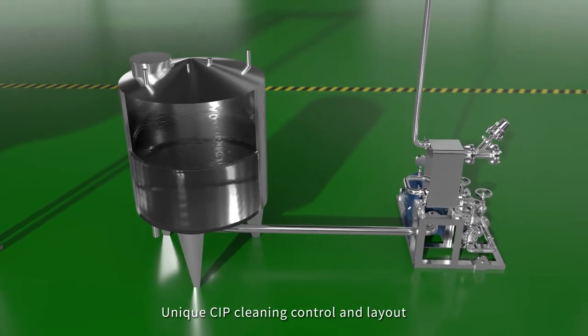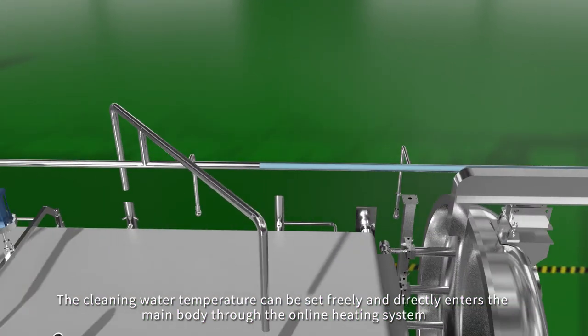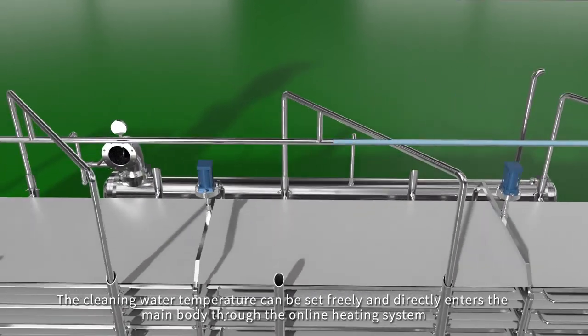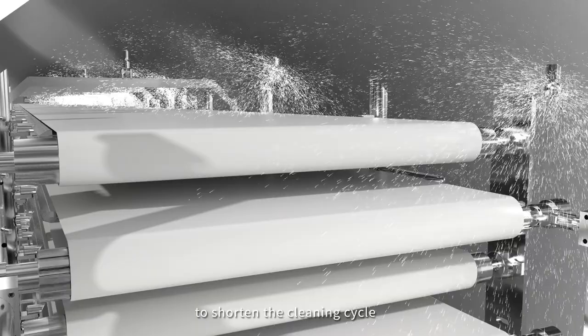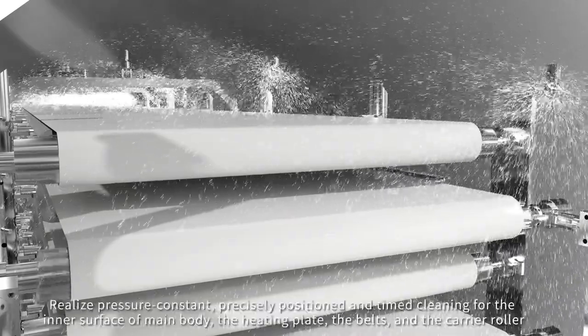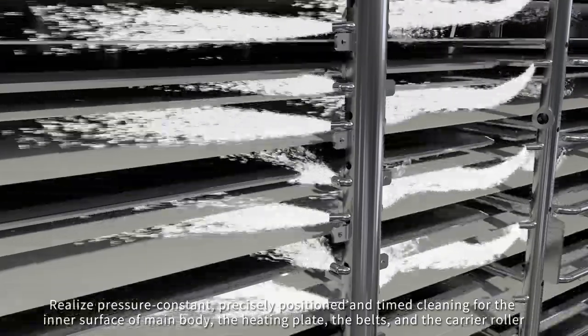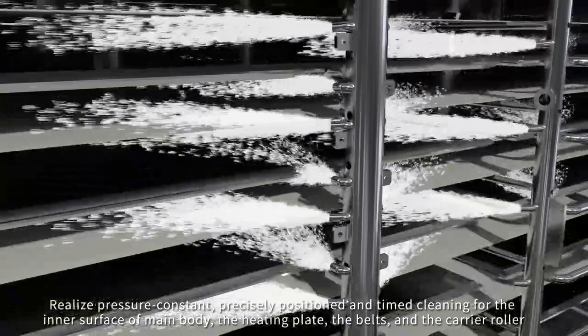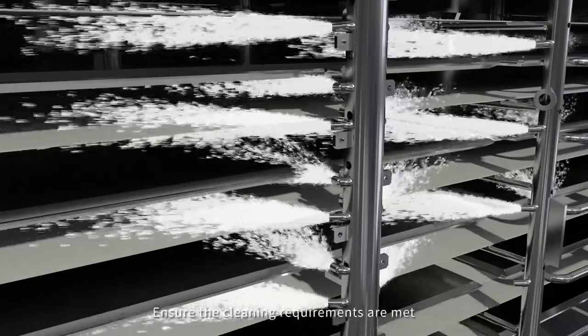Unique CIP cleaning control and layout. The cleaning water temperature can be set freely and directly enters the main body through the online heating system to shorten the cleaning cycle, realize pressure constant, precisely positioned, and timed cleaning for the inner surface of main body. The heating plate, the belts, and the carrier roller ensure the cleaning requirements are met.